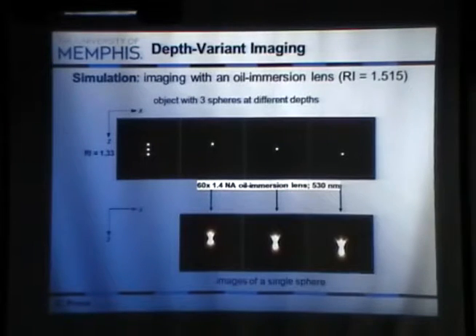We are approaching where we stopped last time. So again, to recap, this is a simulation. This is the basic idea: here's the point, and if you consider this to be at zero depth, now we're increasing the depth. You see the location of the point along Z is shifting, right? And this is the response of the system, and you see that this response is also shifting. If you just look at the middle point of the response, that's shifting, but it's also changing its characteristics, right? The shape, all right? If the system was space invariant, then this pattern would be repeated here. It would just merely shift. Make sense? Okay.